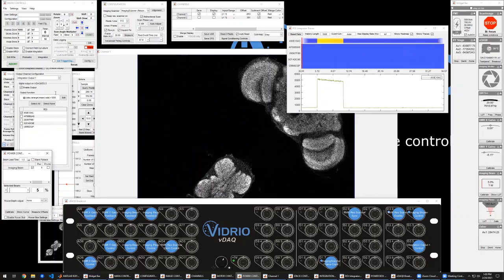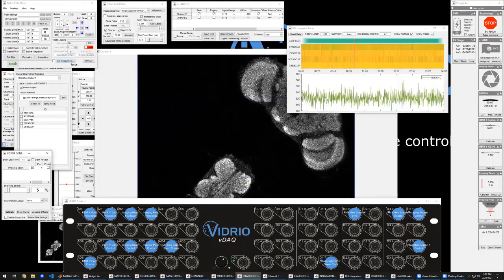And then you can take this trigger and trigger some closed loop aspect of your experiment, whether it's some kind of reward circuit or anything else. So that's just a few ways that you might utilize this interface. So I'll go ahead and turn it back over to Bruce.